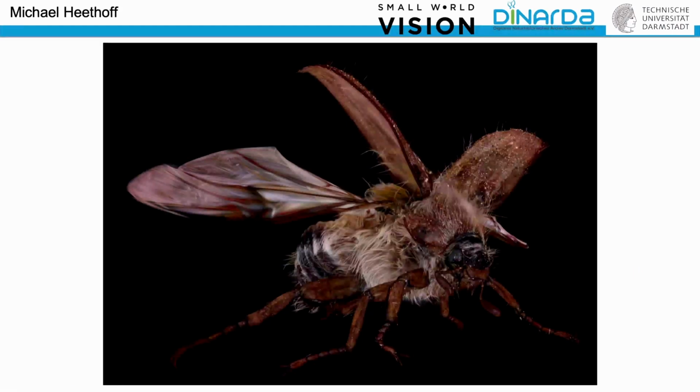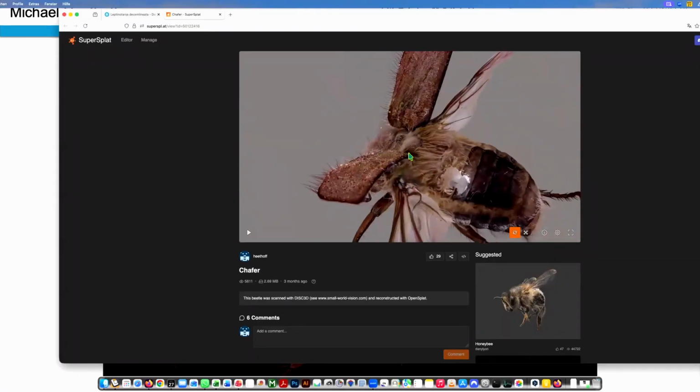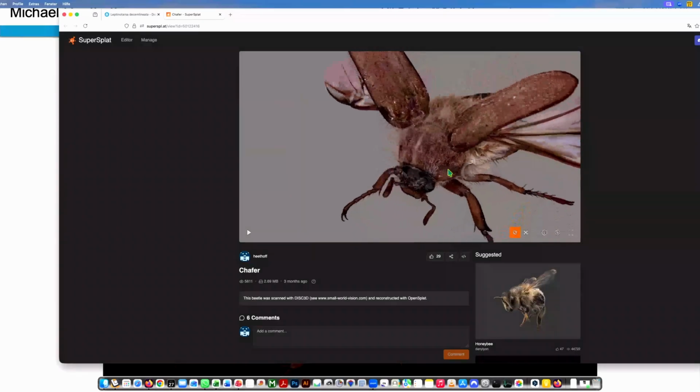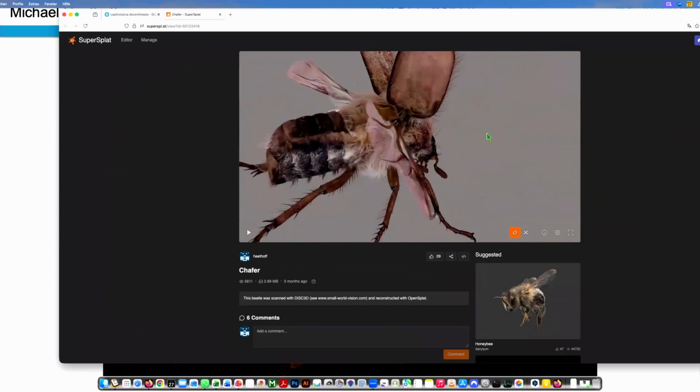It's a lossless PNG compression. But including the model data and so on, you will have maybe 2 GB of space that you need. This is not really a model. This is a real-time rendering. Behind this still are standing all these spheres, and it's just an algorithm that very quickly renders it depending on how I move the object.